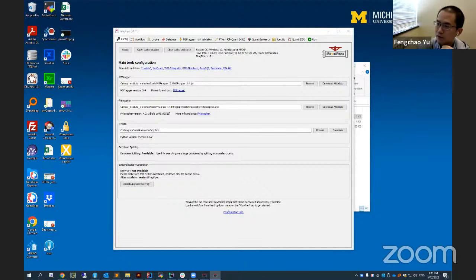Yeah, it supports FAIMS data. You don't need to convert one FAIMS raw file into multiple mzMLs. You have to do that for MaxQuant, but we don't need to do that for our tools. We can support FAIMS natively, even with the raw file format. You don't even need to convert to mzML, but not for TMT, by the way.